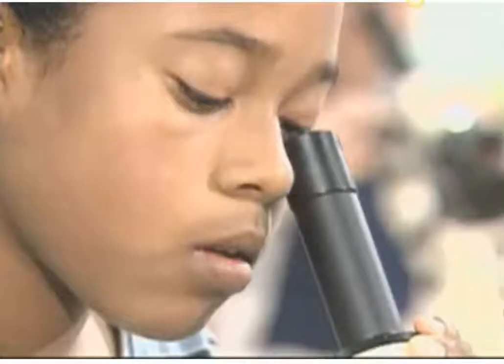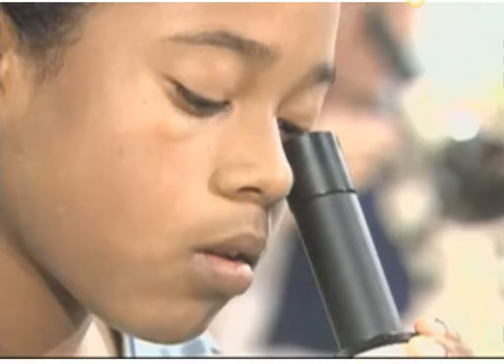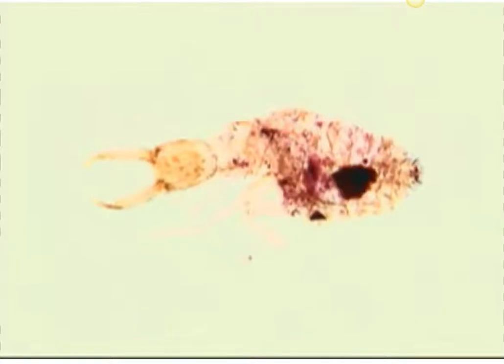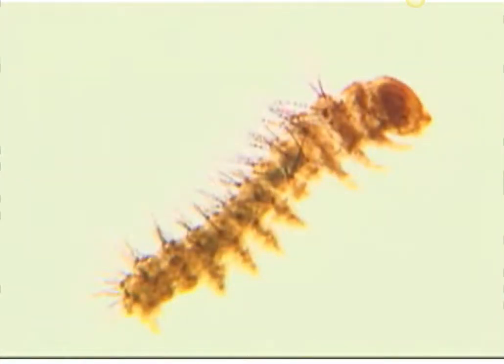The best thing about microscopes is what they can do. They open an entirely new world unseen by the eye alone. This is an ordinary ant magnified 40 times. This is the larva of an antlion. It uses its fierce-looking jaws to snap off the heads of ants. This is the larva of a moth.